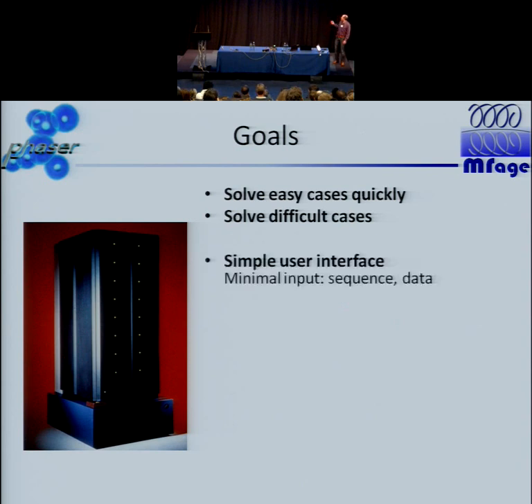We came up with a very simple user interface, or I would say a user interface that is very simple for a very simple case. You only have to specify the sequence and the data. So now I realize that it is not always possible for you to have a sequence for your protein, although in 99.something% of the cases, this is available. If you do not have a sequence, then possibly the next talk is for you. But I can't really help with that, unfortunately. If you do not have data and you are fabricating a structure, then this program is not for you either.